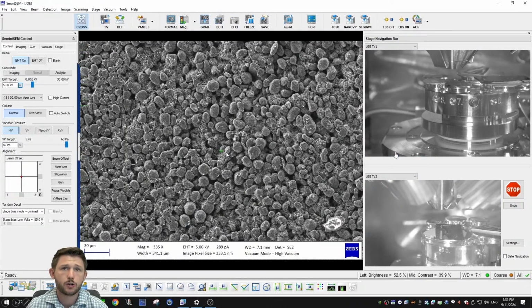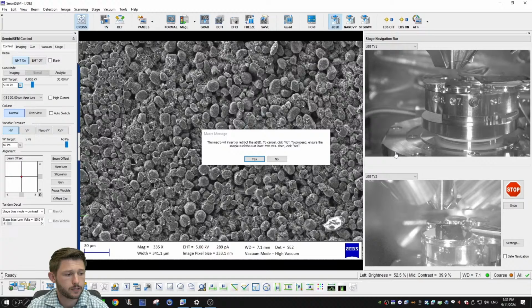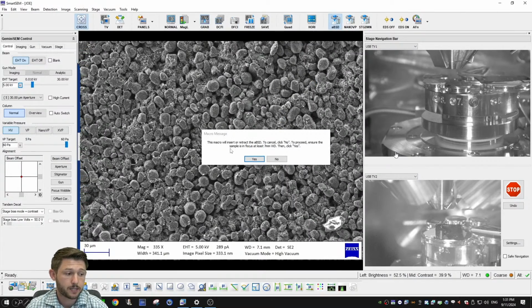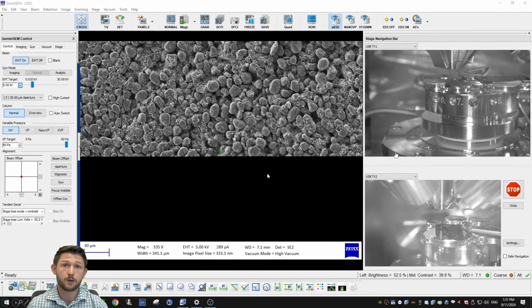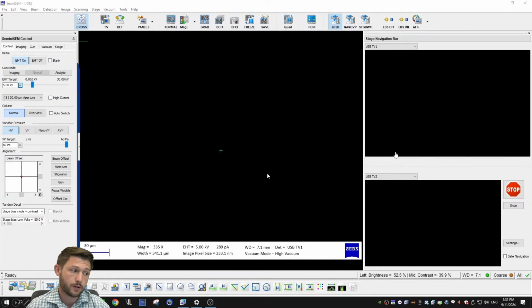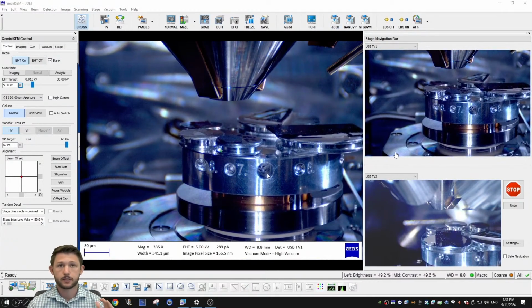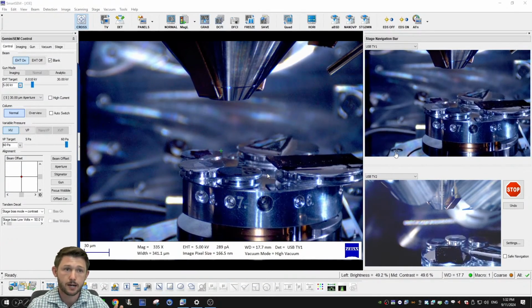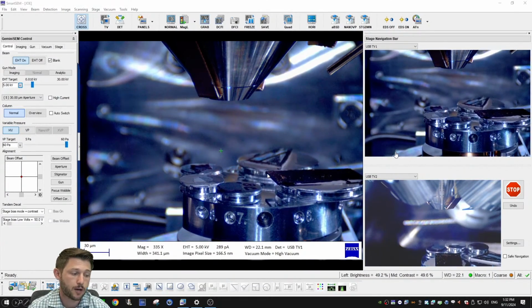The last video I'd like to show is a more advanced workflow, which involves inserting and retracting the ABSD. The interface is very similar to what you saw, where there's a prompt for a yes/no. What's nice about this button is it is all-encompassing, so we'll insert if it's not inserted and retract if it is inserted. So right now it's not inserted. It's going to automatically drop the stage. So everything at this point, again, is autonomous. After clicking the yes, it's dropping the stage.